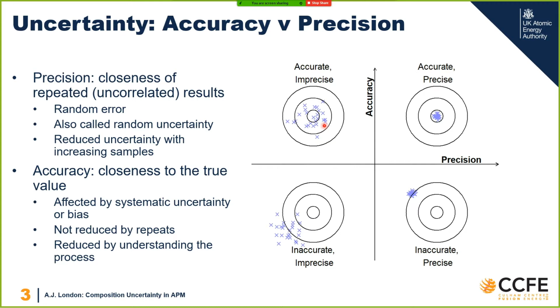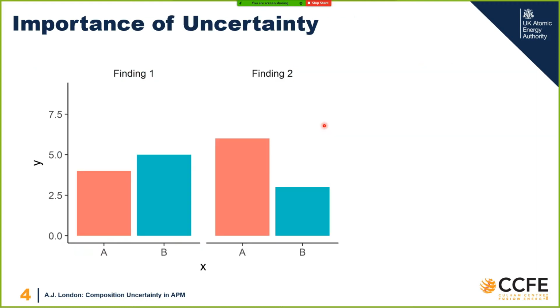But with atom probe, it seems quite difficult to establish good standards because every individual sample that you run has different voltages and evaporation physics and background, and the shape of the tip is different. So how the laser interacts with it is different. So there's a lot of parameters that are actually really hard to control in an actual atom probe experiment. I'm kind of going to assume that we're mostly accurate when it comes to boiling it down to the peak counts. And that may be a flawed assumption, and we'll get to that.